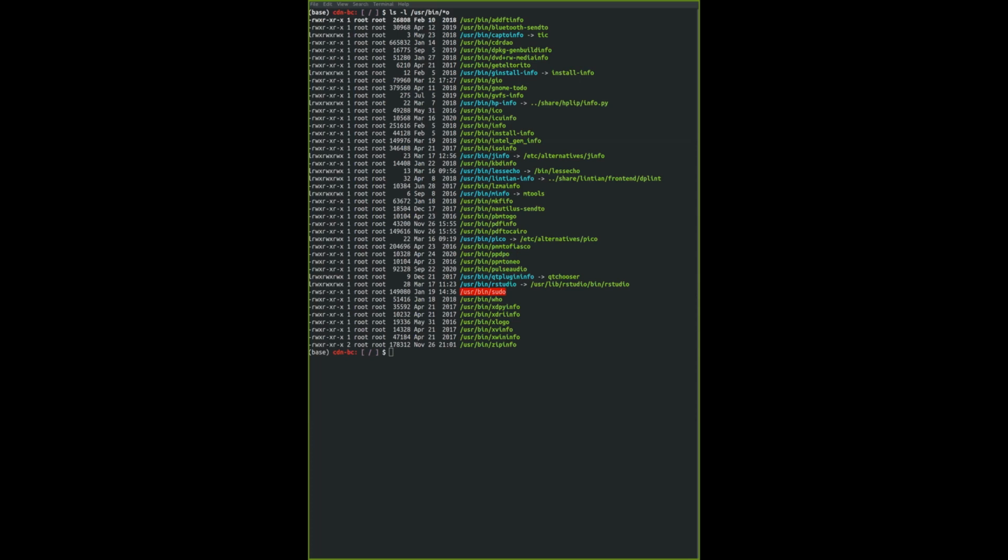I tried everything. I mean, I tried A, B, C, T, F, everything. Can you print your directory for me? Can you do PWD and paste it in the chat? It's /users/Alibora. So where we are right now, you need to be in root. So do a cd with a forward slash. So we are currently in the root directory.